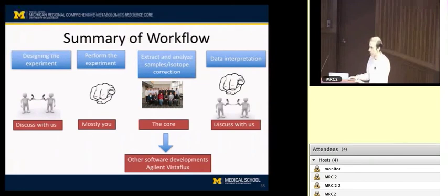There are some circumstances where, if you're aiming for metabolic flux analysis with computational modeling, you probably don't want to entirely replace your media with fully labeled substrate or only a single substrate, because eventually, if you wait long enough, you're going to reach full labeling, and then you have no more information than what you had with conventional metabolomics. There are occasions when you may want to do 50% labeling or something else.